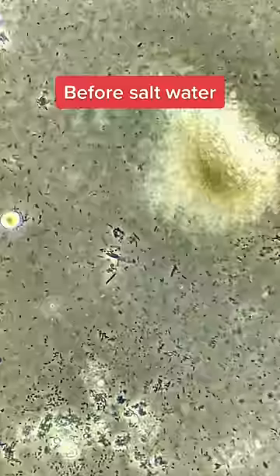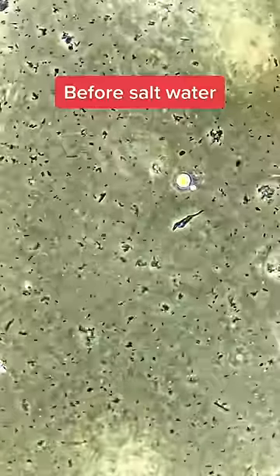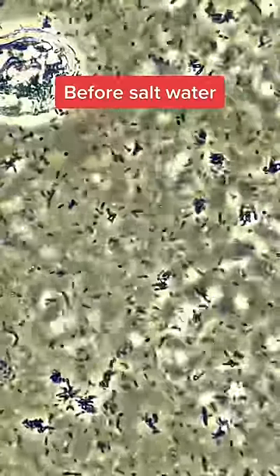This sample is crazy with life. As you can see, the bacteria is very lively. There is tons of movement. The bacteria has no idea what is about to hit them.